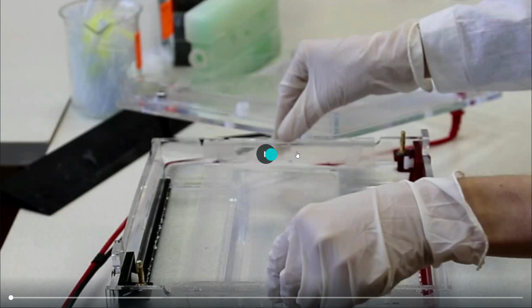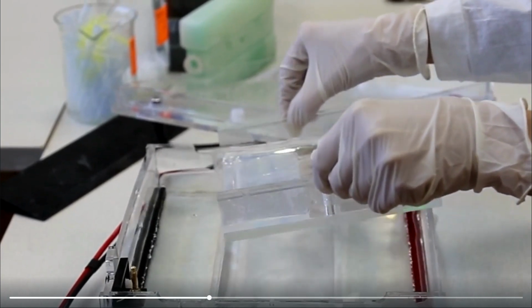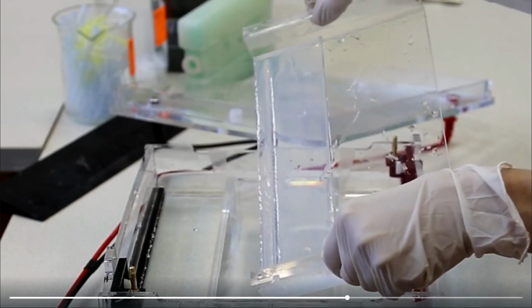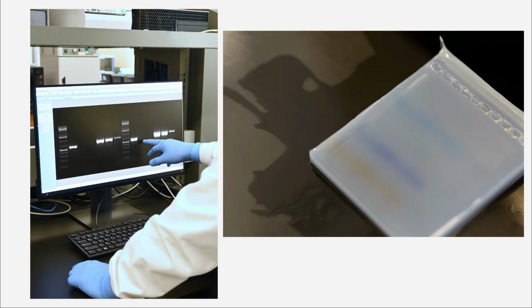Once it is done, we disconnect the electricity and remove the agarose gel carefully. Once the buffer solution and everything is removed, we take this for further analysis. And here you can see the solution added to this well after the separation. You can see the different bands, and different bands are observed using the software.